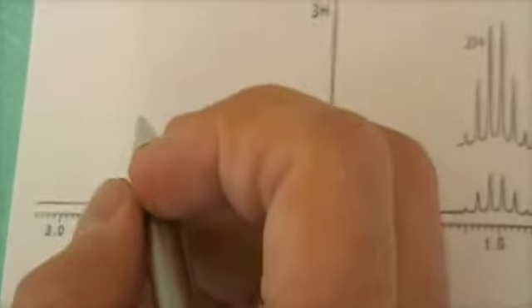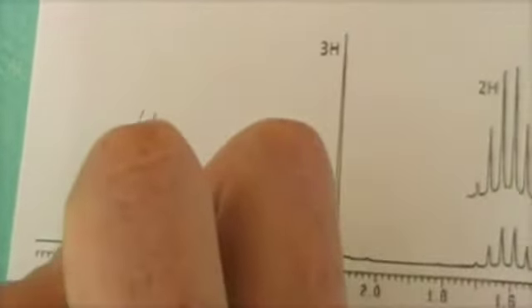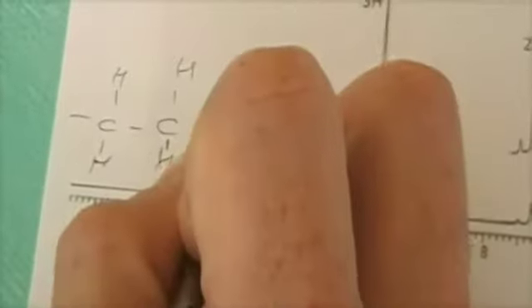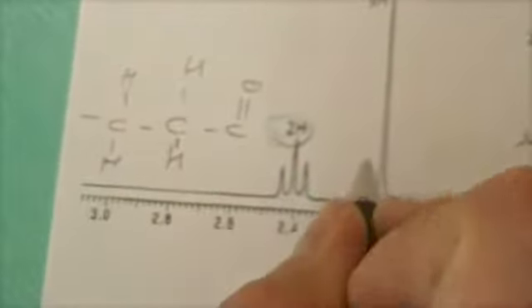And we know here because of that we're probably going to have a carbon that's going to have two protons attached to it. Those are identical protons. And we've got another carbon here that's going to have probably two protons branched off to something else. And then because it's showing up so far downfield, we can be pretty confident that there's going to be a heteroatom involved in this structure.